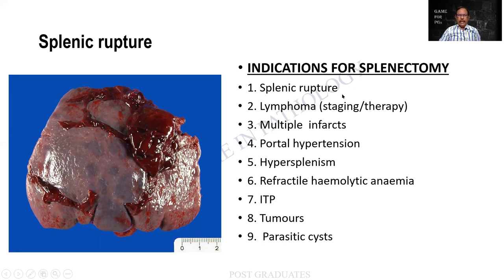Please do have it in mind, and there should be a logical sequence with which you people should answer. So look at the tear over here and the hematoma that is there, and obviously the spleen itself is enlarged.